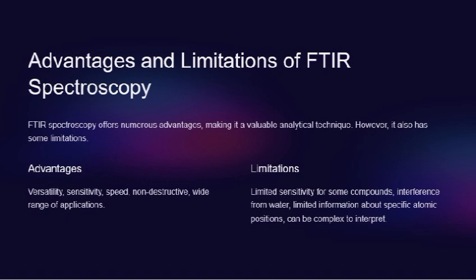And its limitations are that FTIR spectroscopy has limited sensitivity for some compounds, interference from water, limited information about specific atomic positions, and it can be complex to interpret.